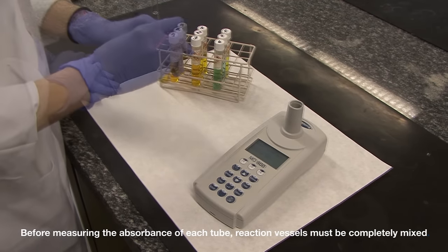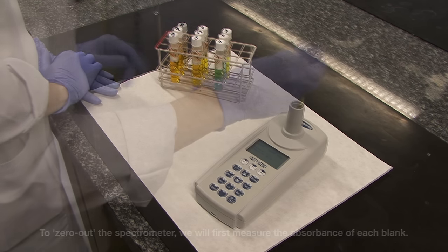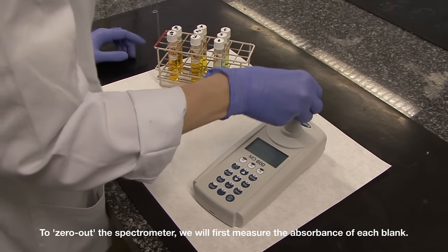Before measuring the absorbance of each tube, reaction vessels must be completely mixed. Now, it is time to use the spectrophotometer. It has to be set at a wavelength of 600 nm.